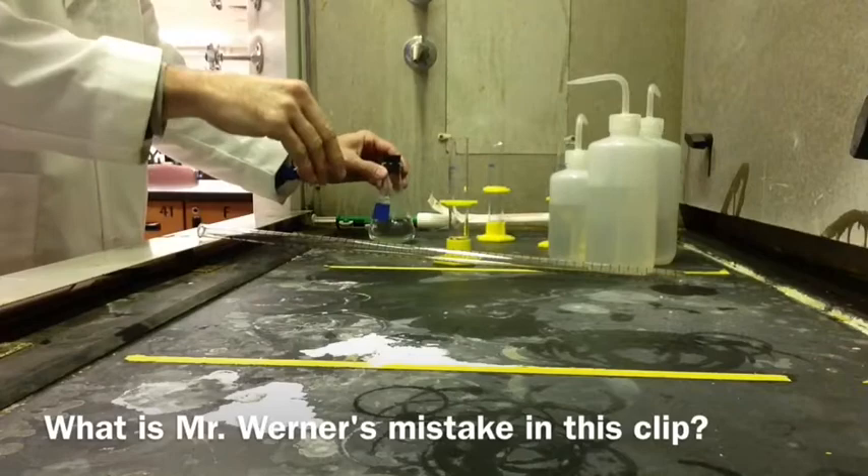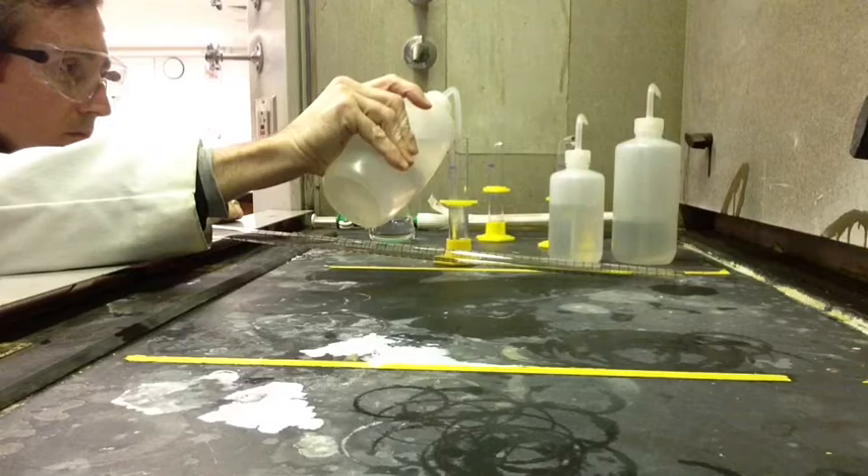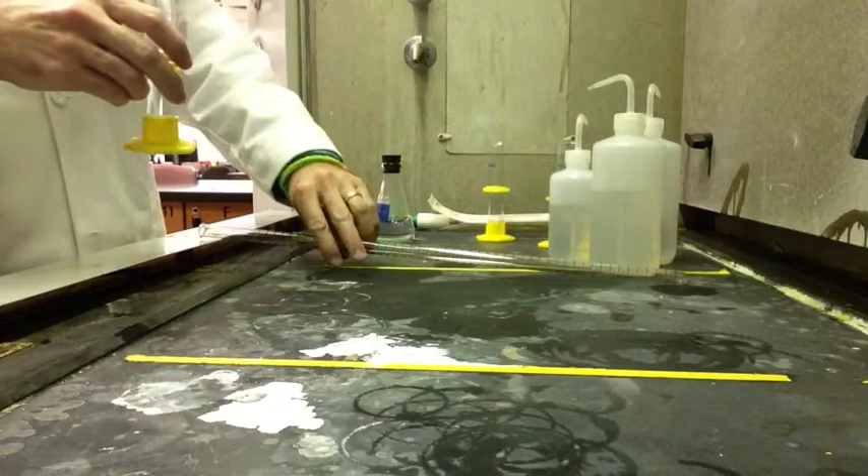I make a mistake in this clip, and that's going to be one of the questions on the quiz. What procedural mistake am I making here? Altogether, you're going to have 20 milliliters. However much acid and however much water — when you do your calculations — you're going to have that together.